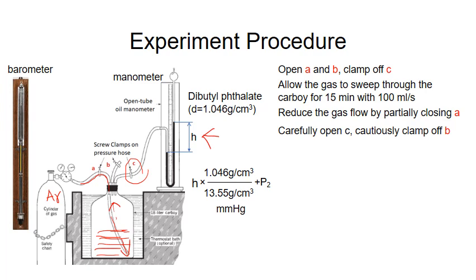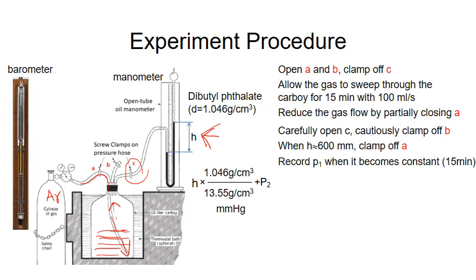To measure accurately, we need a large value of this height, but not too high, because that could also blow away the liquid. The optimum height is 600 mm. So when H approaches 600 mm, we close clamp A. Now the carboy is sealed and connected to the manometer. At this point, you will see the height may slightly change with time, so let it stabilize for about 15 minutes.